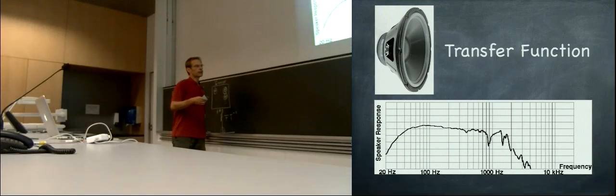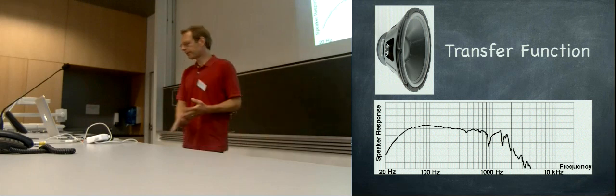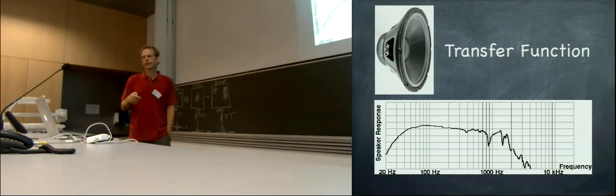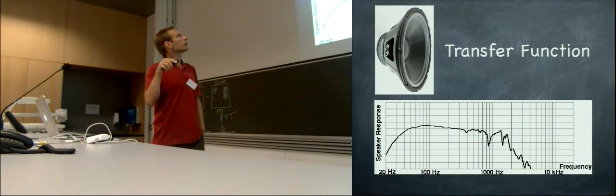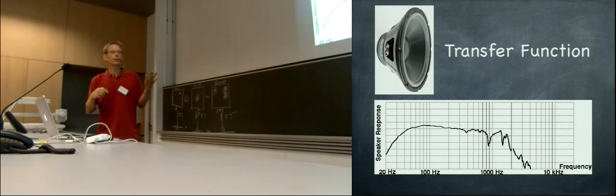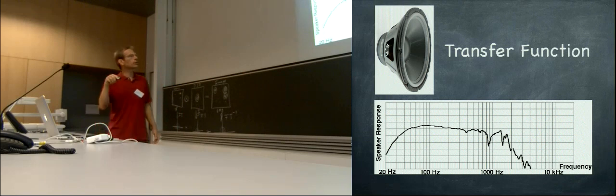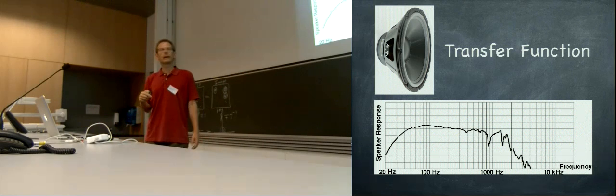So a transfer function is a function that describes how our machine records data and transfers it to the recording media. Here's another transfer function, which is the transfer function of the subwoofer, loudspeaker. We have music recorded on a CD, perfect music, and then you want to transfer this into sound, into our ears, and this transfer function describes what this lousy speaker does to it.